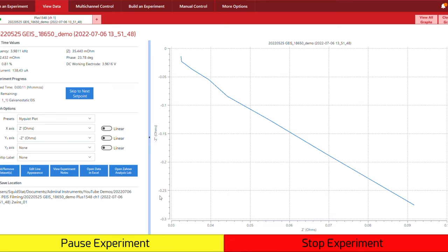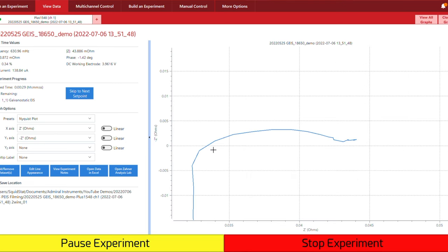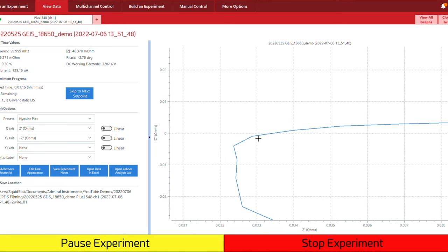The particular area that we want to pay attention to is where the impedance first crosses the x-axis — where the imaginary impedance is at zero and the only impedance that we're measuring is the purely resistive component. Now we can zoom in on that point and see where it is. From this result, it looks like where it crosses the x-axis is around 0.03 ohms, perhaps closer to 0.034 or 0.033 around there. Now we can stop this experiment a little bit early because we already have the data that we need.